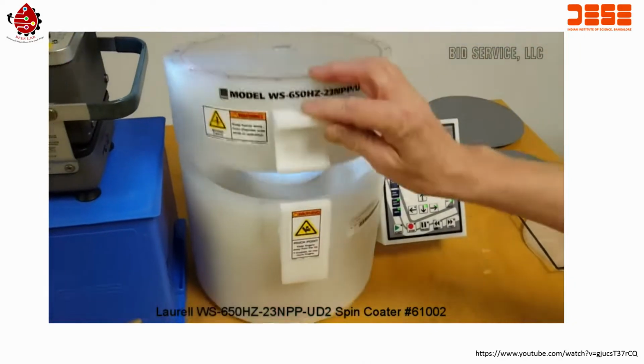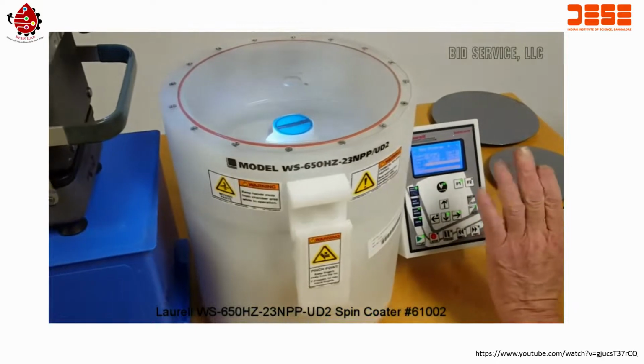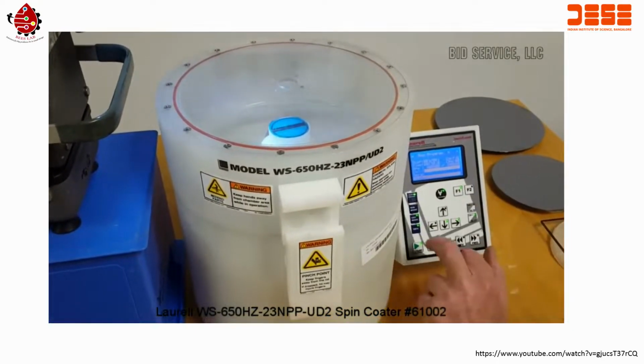Lid. We're done. It'll always say done, and after you lower the lid, as long as your vacuum is satisfied and your nitrogen purge, it'll tell you that it's ready.